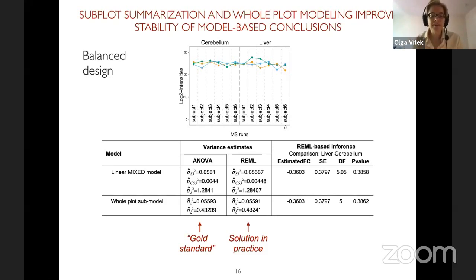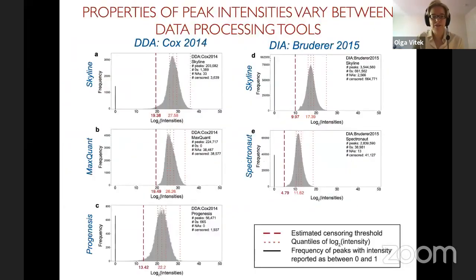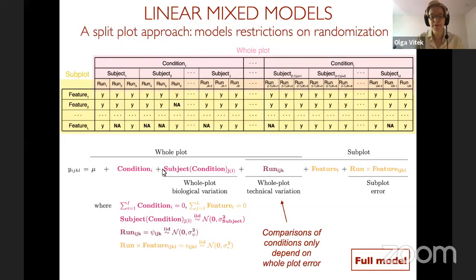And also the variance on the original scale is very much a function of the intensity, right? So highly abundant analytes are more variable. The log transformation mitigates this somewhat. On the log scale, it tends to be the opposite: low intensity features are more variable, high intensity features are less variable. So is it exactly normal? No. Is it better than the original scale? For sure. A lot of the assumptions that we make are approximate, but let me add one more thing, which answers a question from another person. An important assumption that we make in this type of model is not just that the data are normal, but that the measurements are independent.